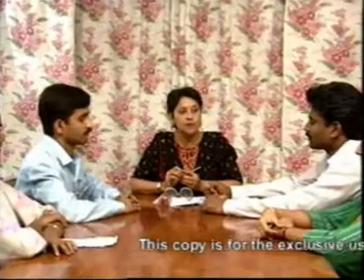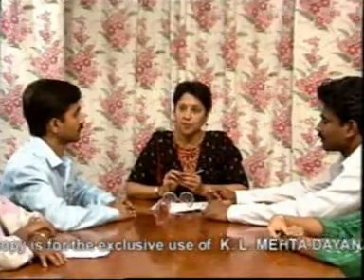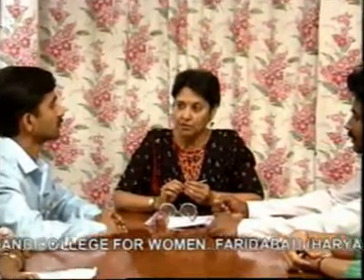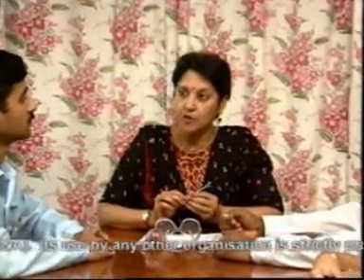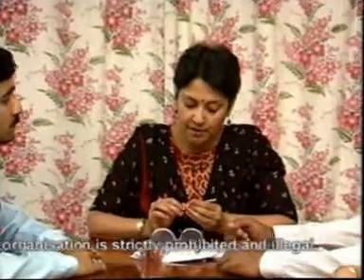So in this group discussion, we have discussed some of the general problems that we encounter during tissue culture. For example, problems which were of chemical nature, problems which were of biological nature, and problems related to physical factors. And these problems were like browning of the explant or callus, vitrification of the cultured material, habituation of the explants and the growing callus or tissues, non-totipotency, physiological disorders, genetic variations, absence of uniformity, and epigenetic traits and their control over our cultured products.